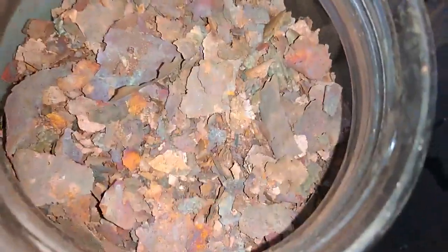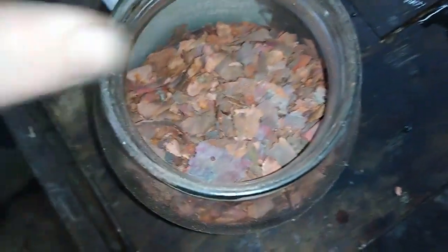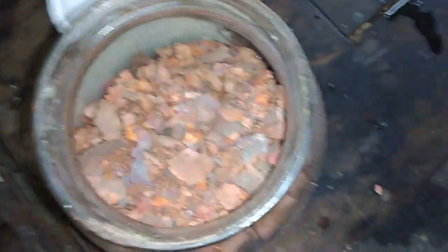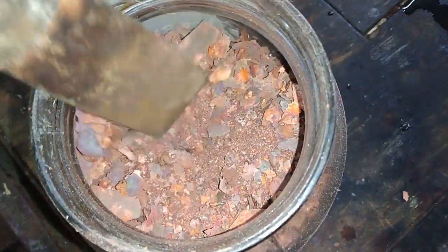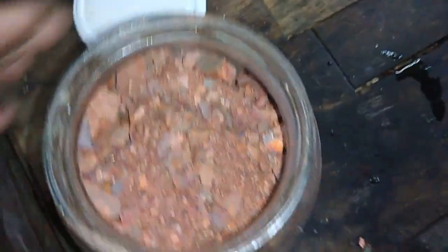I put it to dry — this is all the copper I harvested from this round. You can see it's dry. I'll collect it in the jar and leave it until I have a bigger amount, then I'll melt it.